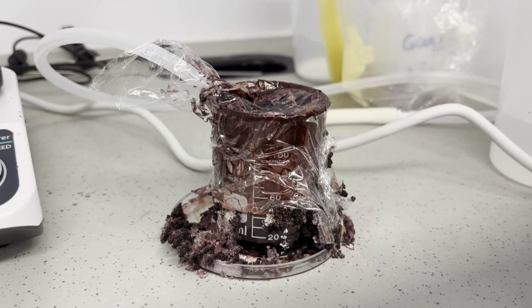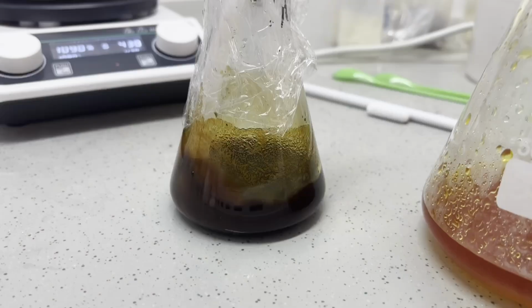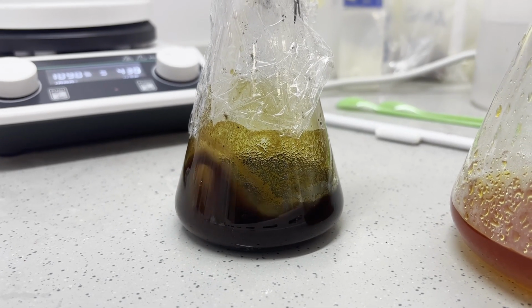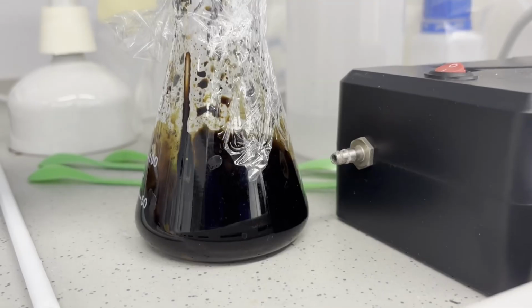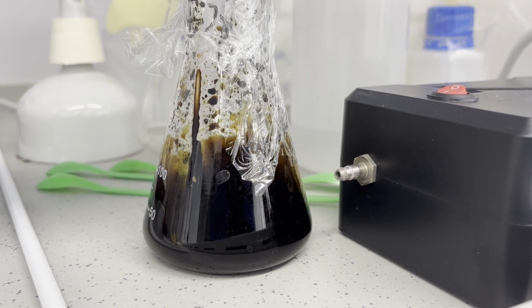But in the end, all that's left is some weird pinkish compound, probably the aqua complex mixed in with remaining ammonium chloride salts. The second attempt was done at a slightly bigger scale, but the result is similar. However, my third attempt that used hydrogen peroxide as an oxidizer instead of air was successful. The key is to heat the mixture to 60 degrees C for an hour after completing the oxidation, to facilitate a ligand exchange between water and ammonia.